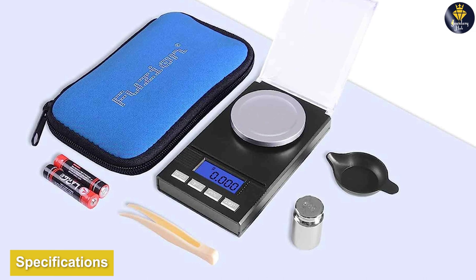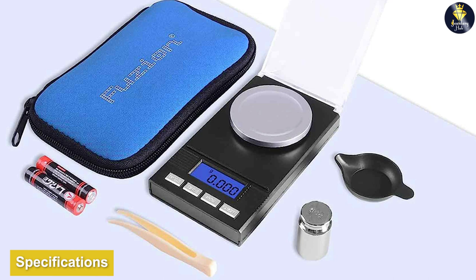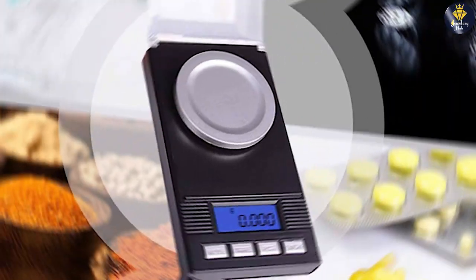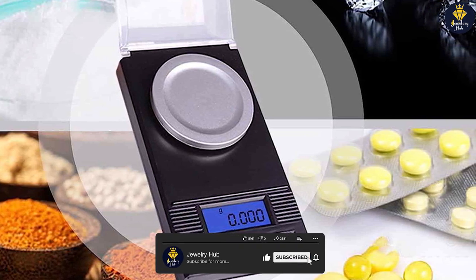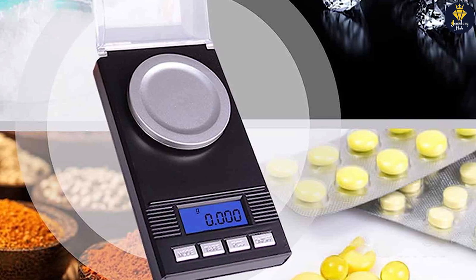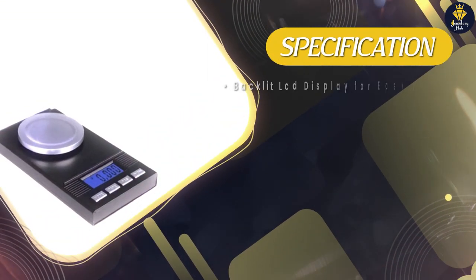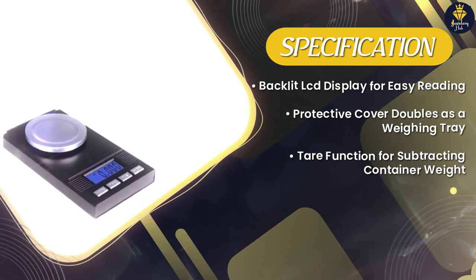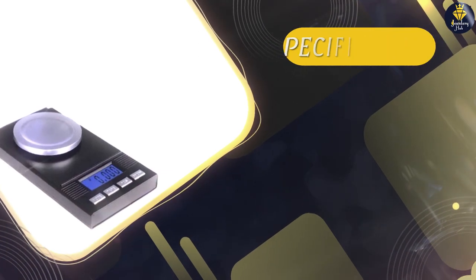Let's begin by discussing the specifications of the Fusion Digital Milligram Scale PL50. The scale is designed to provide precise measurements in the milligram range, making it ideal for a variety of applications such as jewelry making, scientific experiments, or herbal medicine preparation. The Fusion PL50 has a maximum capacity of 50g and offers a readability of 0.001g. It features a high-precision sensor system that ensures accurate and consistent readings. The scale operates on two AAA batteries which are included with the purchase.